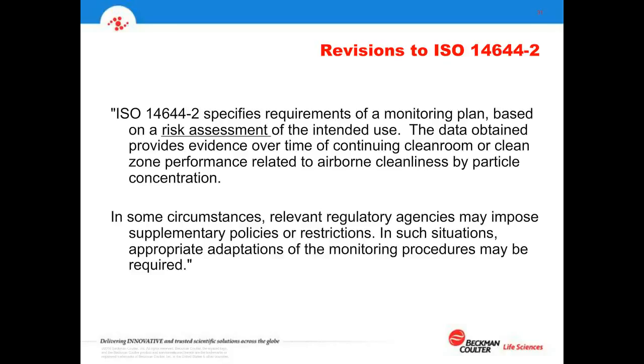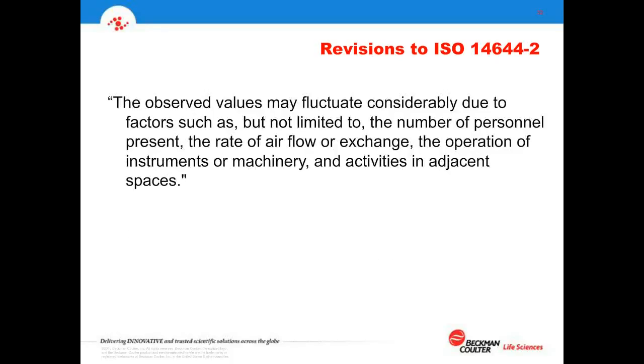And in this document, though, we do mention that, yes, there could be some regulatory agencies that have different methods. So we'll touch briefly as we finish this talk about the GMP documents, the Annex 1 and so forth, that many people in the biopharmaceutical industries need to address. So it says there might be some other things that even supersede this. There's a general discussion of monitoring and things to consider, think about, and plan for, but there may be other methods and controls depending on your type of industry. There's some various counsel in here thinking about the things that can affect particle counts in a room, the airflow, the number of people, and so forth.